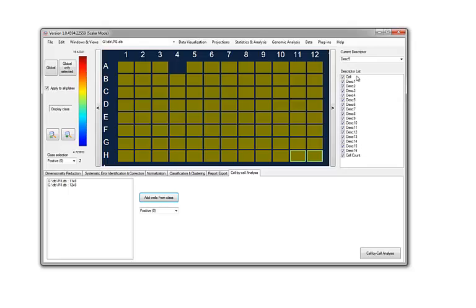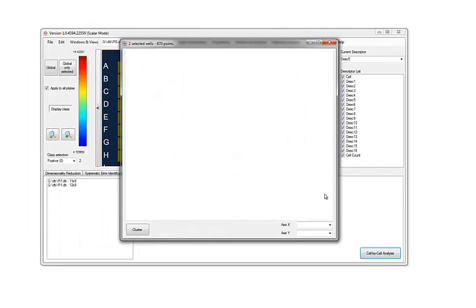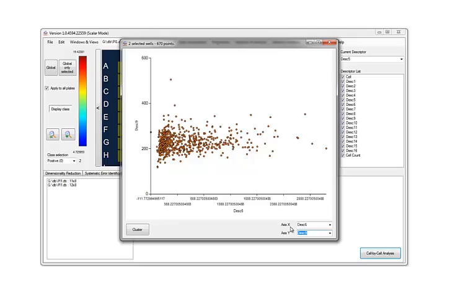You have to pay attention to the descriptors that are selected. All the descriptors that are selected are the descriptors that will be used to perform the classification. So choose well what you need at this stage. Here you have such a window that is appearing where we can display the data regarding the different descriptors of interest.